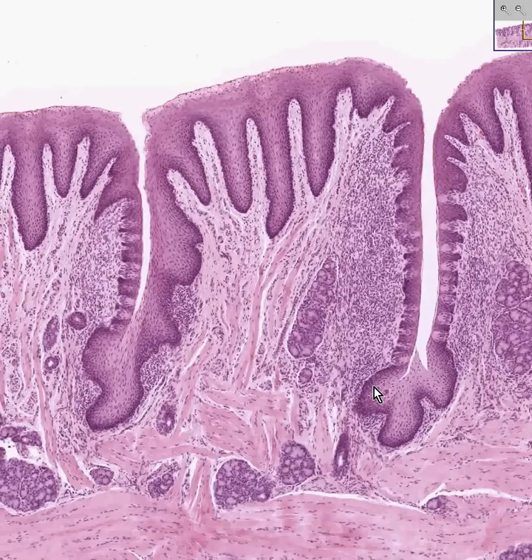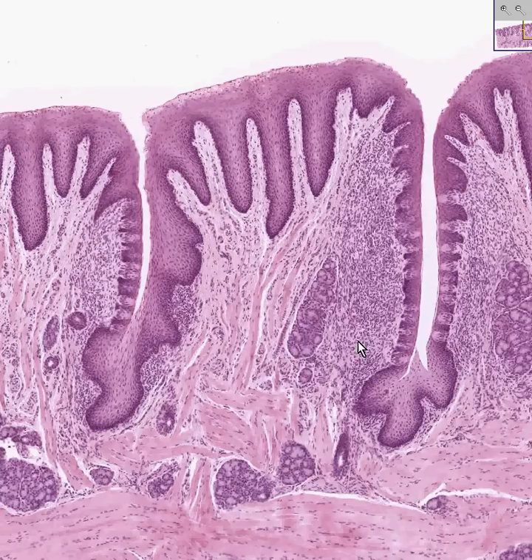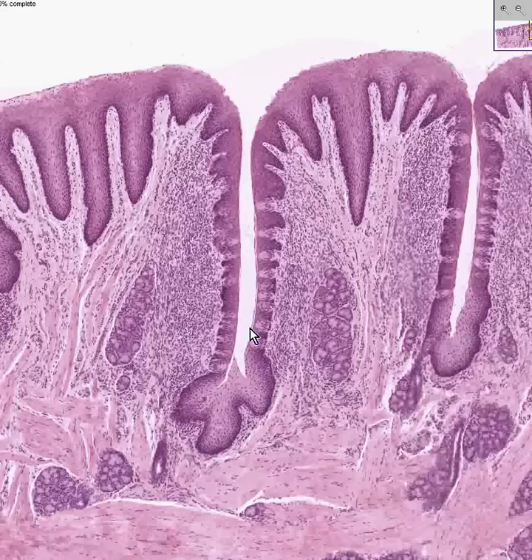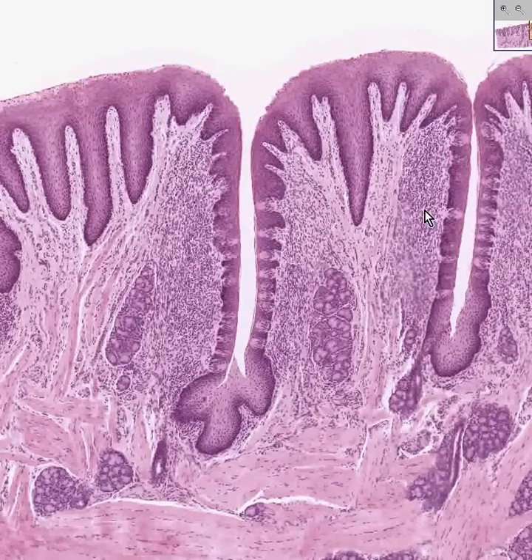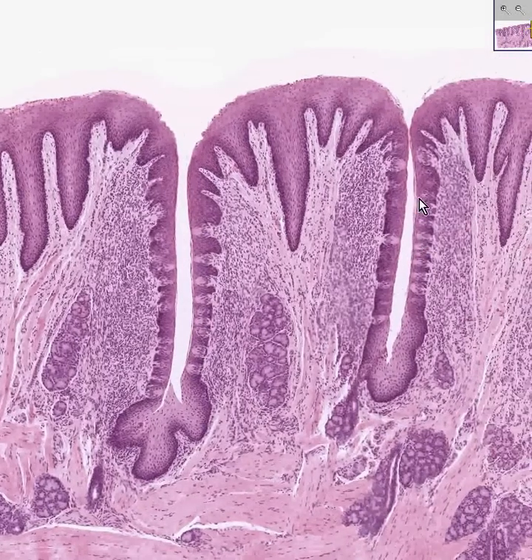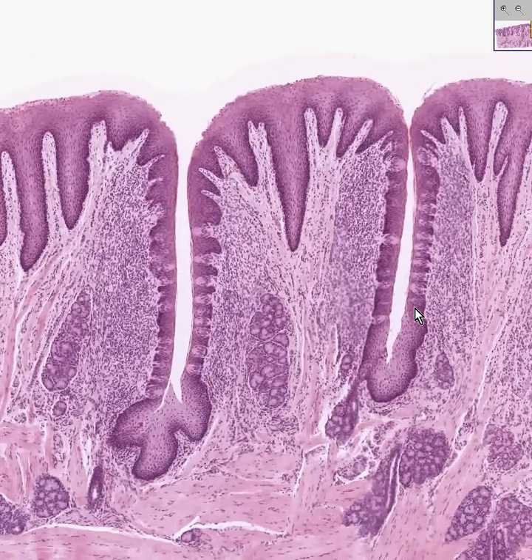Foliate papillae also contain taste buds. There are four kinds of papillae in your tongue. The circumvallate, which we saw, has taste buds. These foliate papillae, which are more squared off, also contain taste buds — very similar to the ones we saw in the circumvallate. And then you have fungiform papillae, which are more numerous anterior to the circumvallate papilla and much smaller.